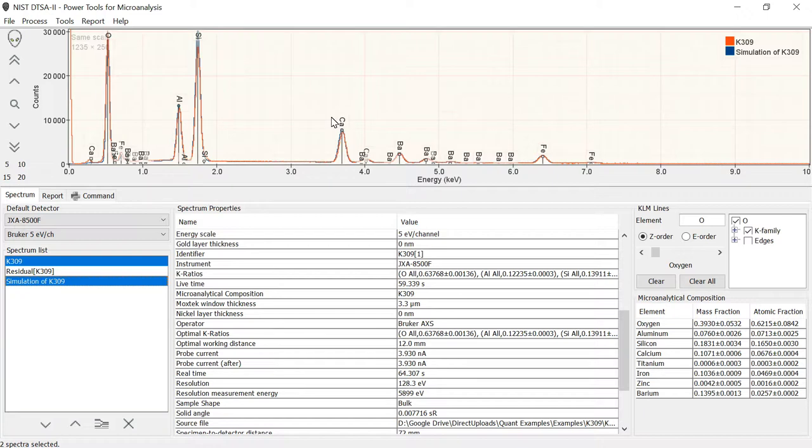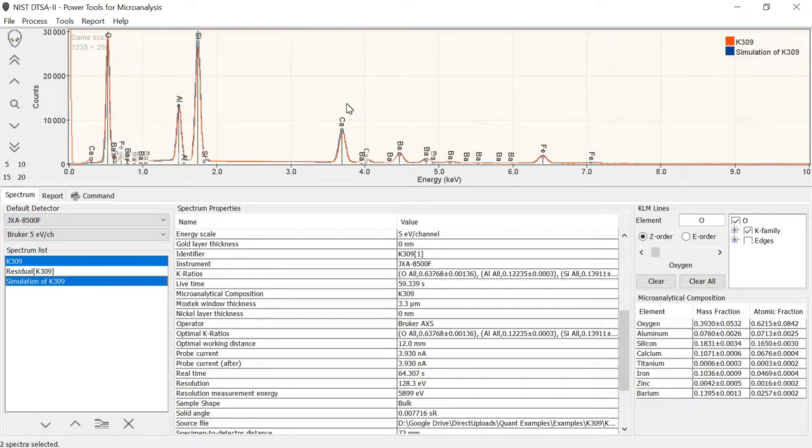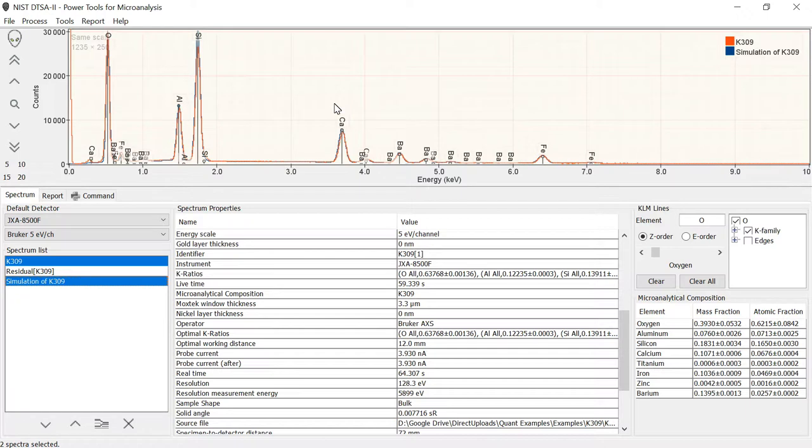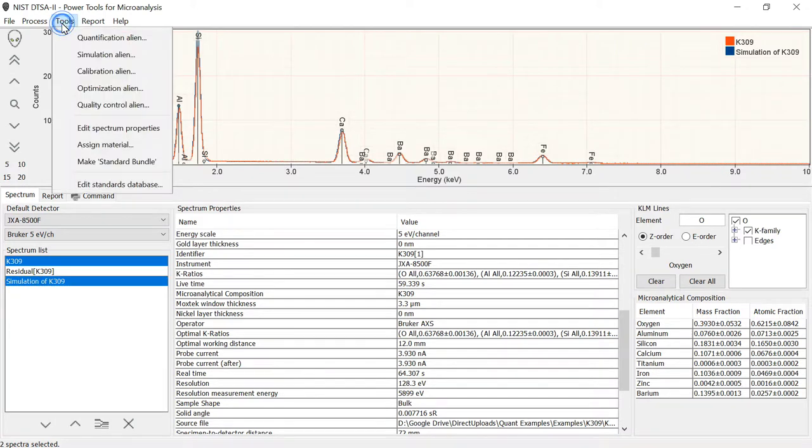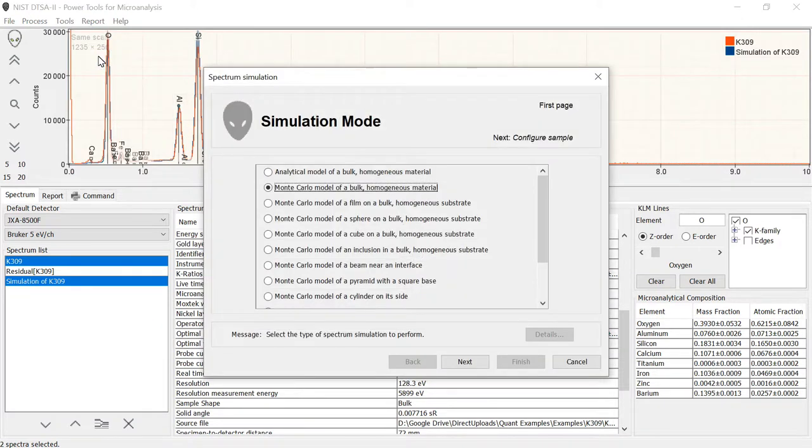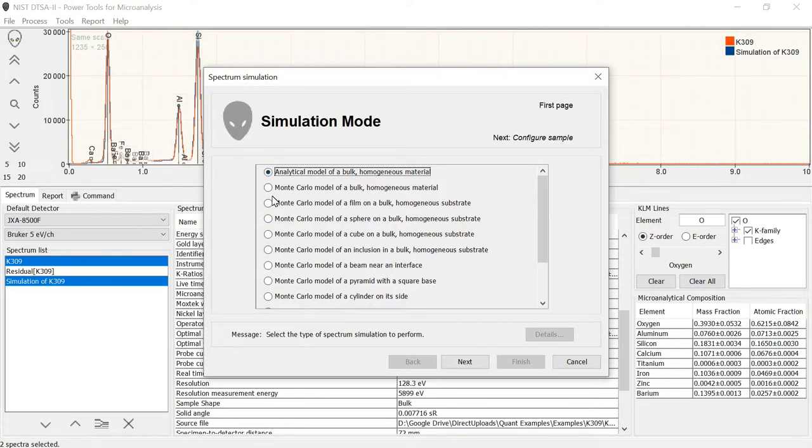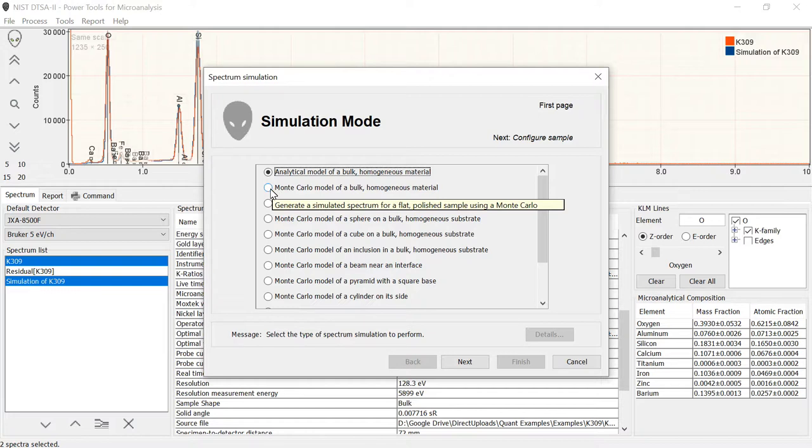This simulation here was what we would call an analytical spectrum simulation. It used the algorithm used for the phi-rho-z matrix correction, which is called XPP. It's the simplified model of Pouchou and Pichoir to actually perform the spectrum simulation. We also can simulate spectra using another tool. This tool is available from the tool menu and it's called the simulation alien. The simulation alien gives you various different modes. We already discussed the top mode, this analytical model, this would be the same model that was calculated here using the Pouchou and Pichoir analytical phi-rho-z curve.